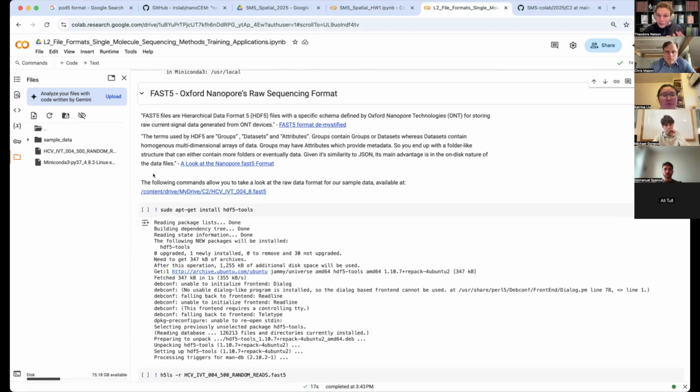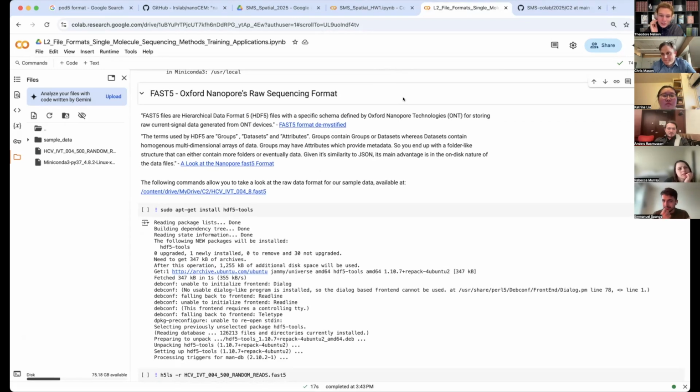So let's just do another yes/no question. How many people have heard of FAST5 files? Yes, no. Well, that's true. If you look at the history of Nanopore file formats, they have a history of regularly changing them. I think that's something that their customer base really appreciates, and that's why they're very loyal. But they've changed them a lot, and so at the beginning they were, in a sense, less usable, and then they became considerably more usable over time.